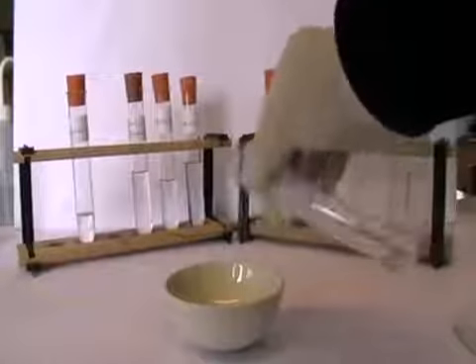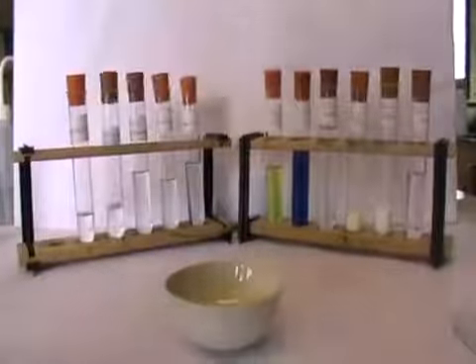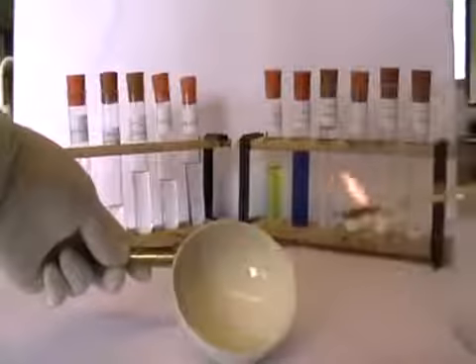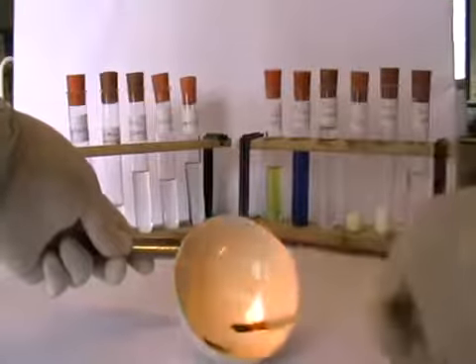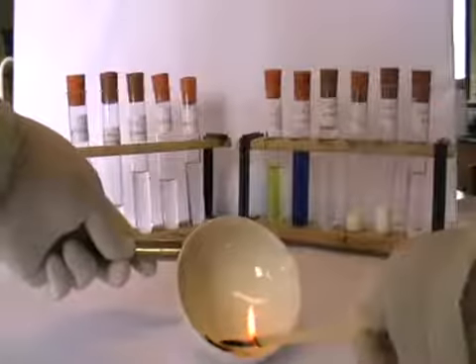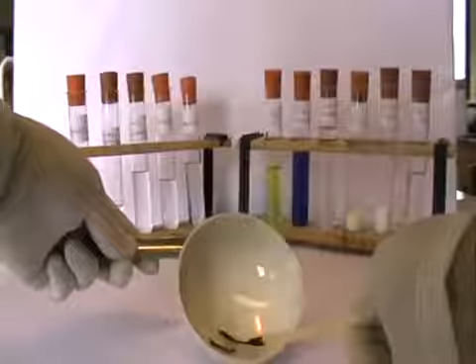Let's pour some of this out into the evaporating dish, and now I'm going to try to ignite it with the lighted splint. And no, there's no sign of glacial ethanoic acid being flammable.